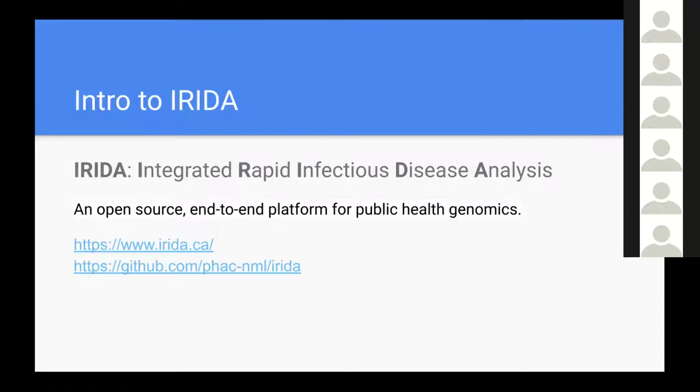And there's also a GitHub site because it is all open source. You can see all the source code, and if you have any requests or additions or bug fixes, or those sorts of things, then it's a very actively maintained project. So the GitHub site is a great resource as well.